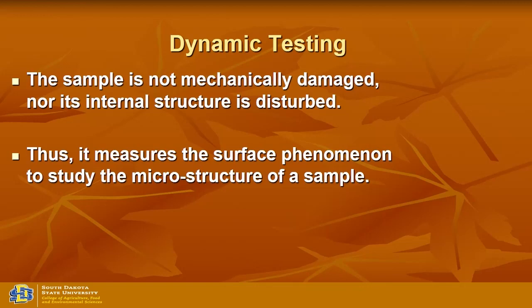This is different than what we have been talking about so far. We have been talking about compression testing, but this is totally different from compression testing. Here the sample is not mechanically damaged, nor is its internal structure disturbed. In previous cases, we were really compressing the sample, so damaging the sample, and the structure also gets disturbed, because after the test the sample is of no more use, you throw it out.